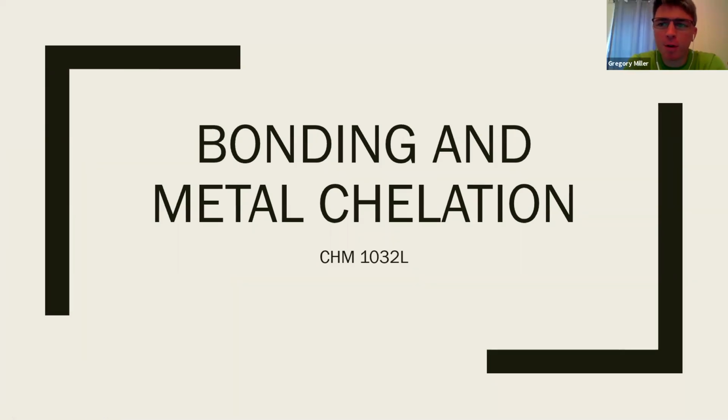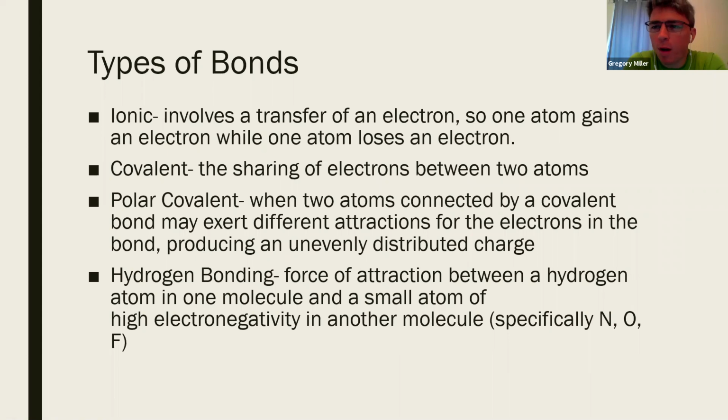Today I'll be going over the pre-lab talk for the Bonding and Metal Chelation lab. So normally this lab was about molecular geometry and VSEPR theory, valence shell electron pair repulsion, talking about the way molecules are shaped. And if you're in the lecture, you'll probably get into that topic.